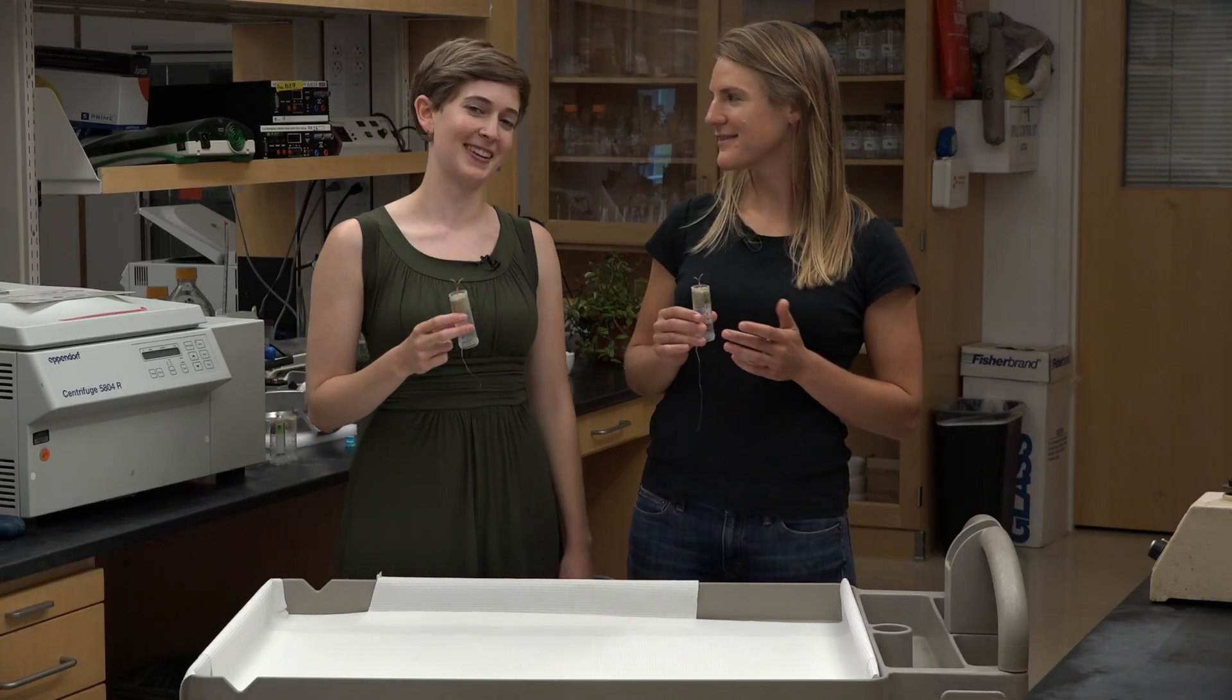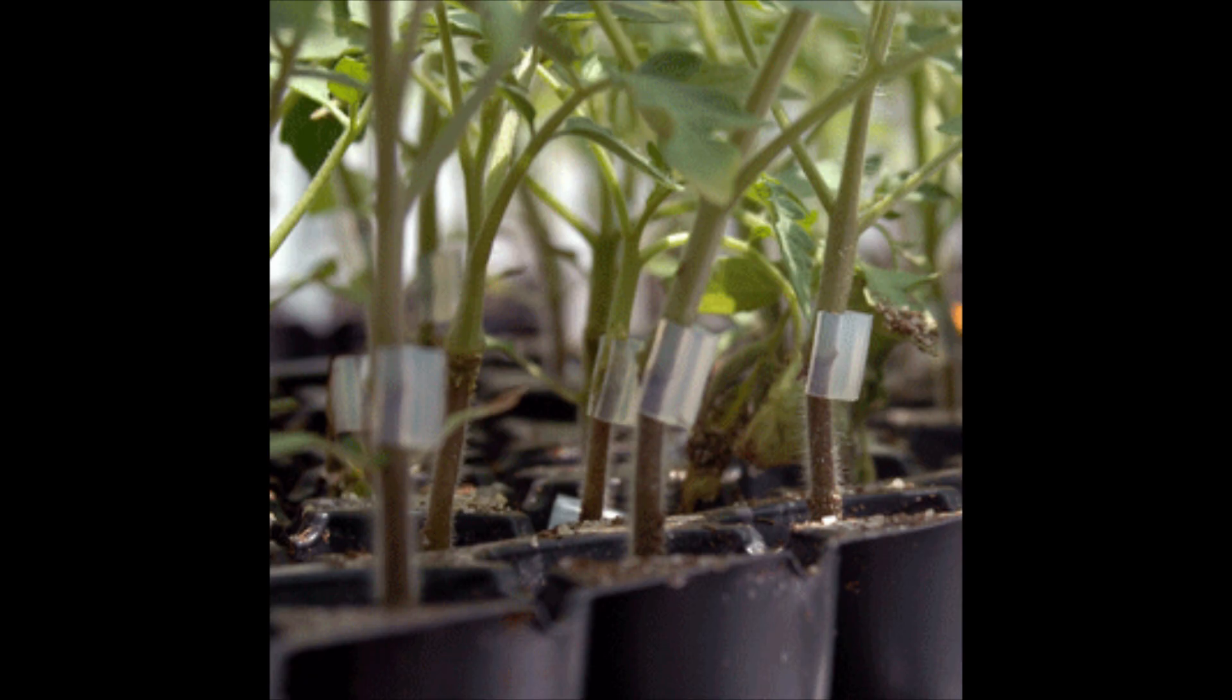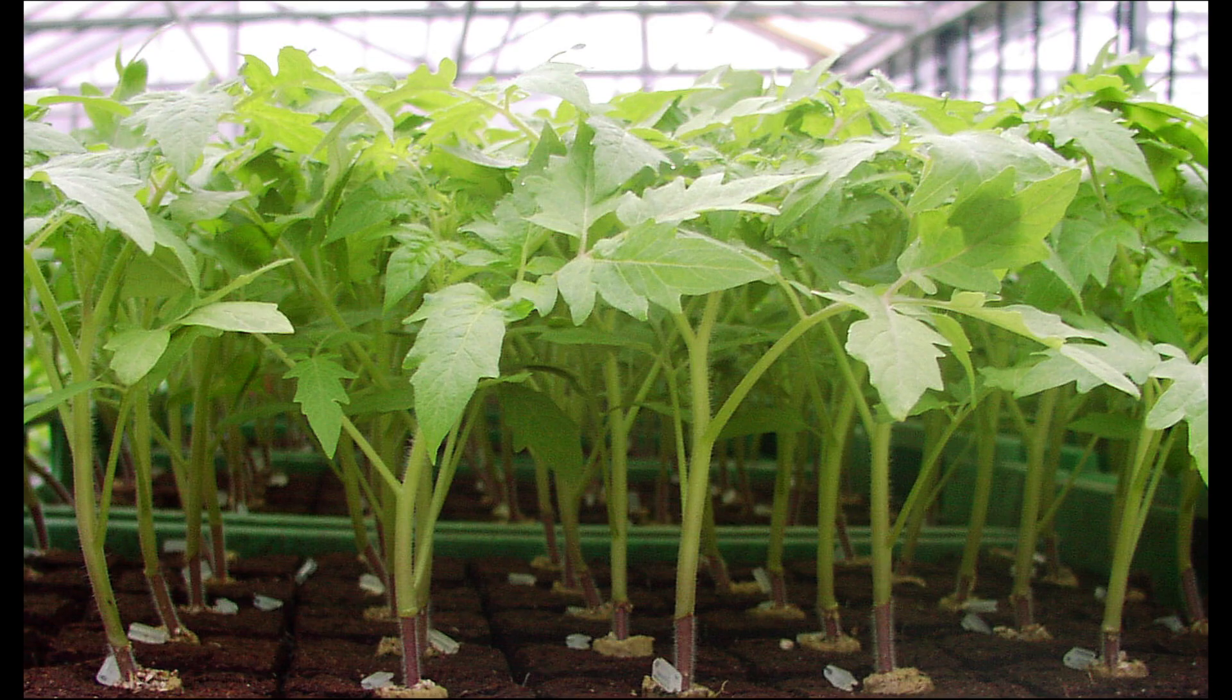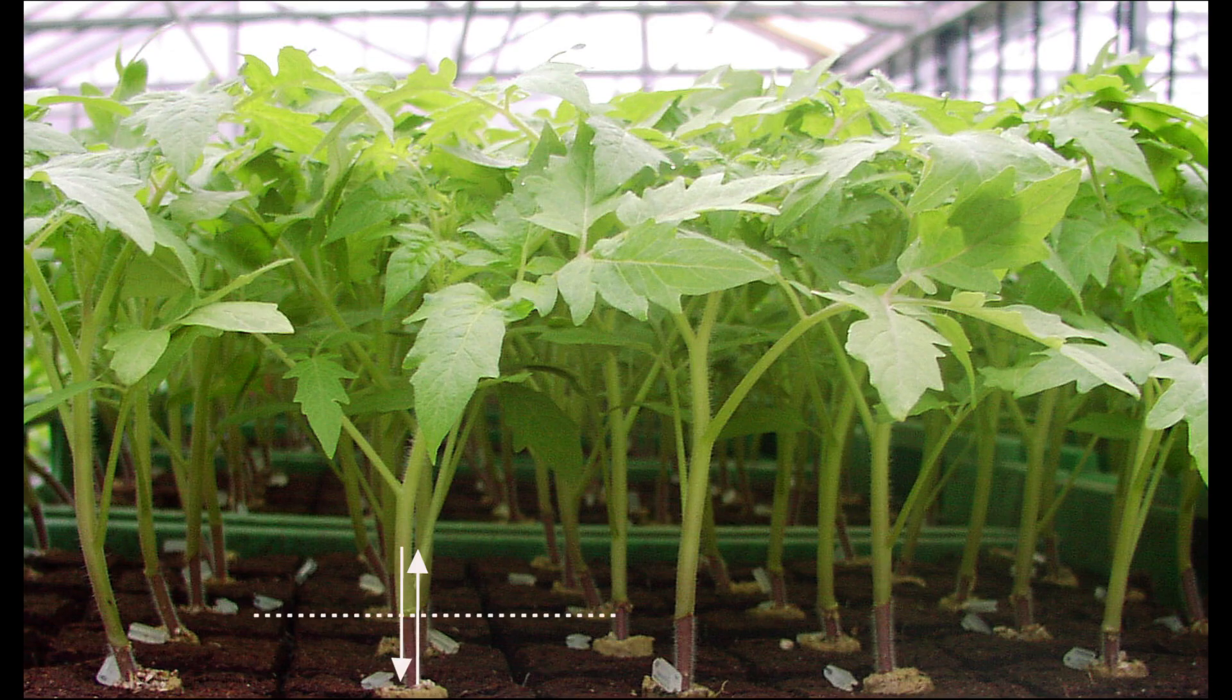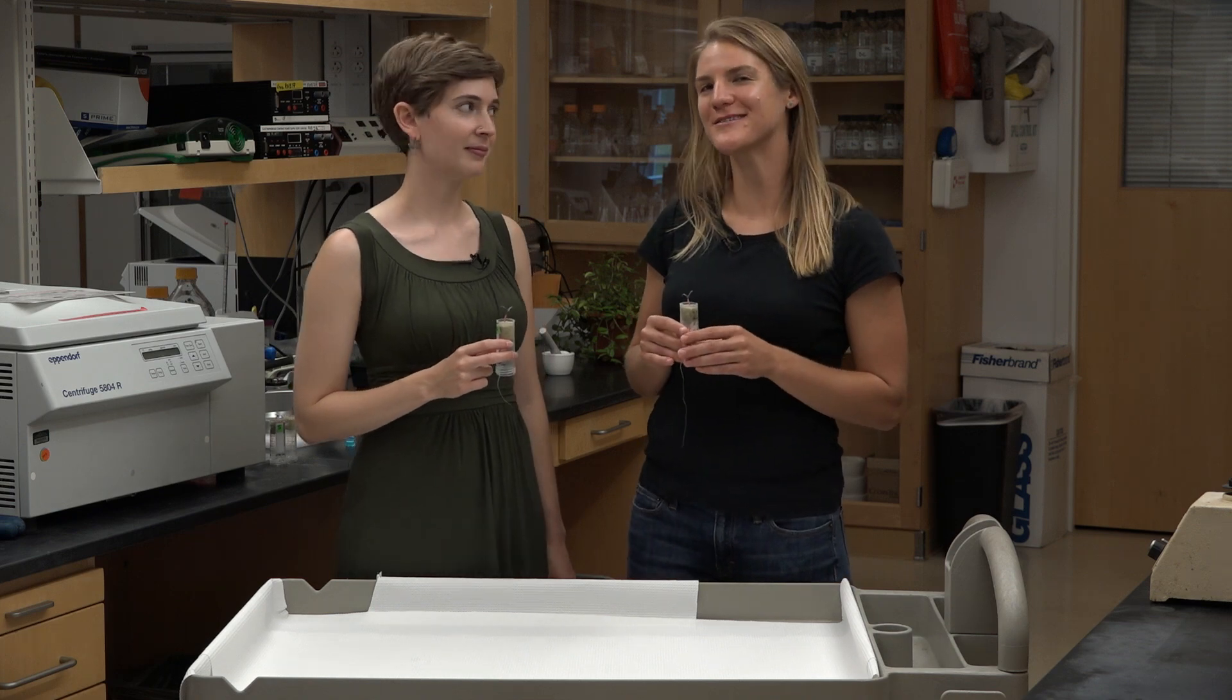So how do we know if our grafting experiment worked? When farmers use grafting techniques on their crops, they wait to see if the grafted shoot heals and starts producing new leaves and fruit. But I'm researching exactly when the vasculature reconnects between the root and shoot, which we can't tell at this early stage simply by looking at the plant. Instead, we watch the transport of the products of photosynthesis.